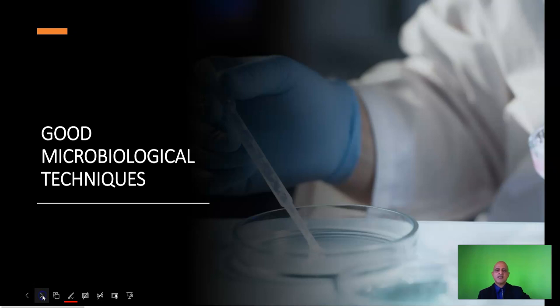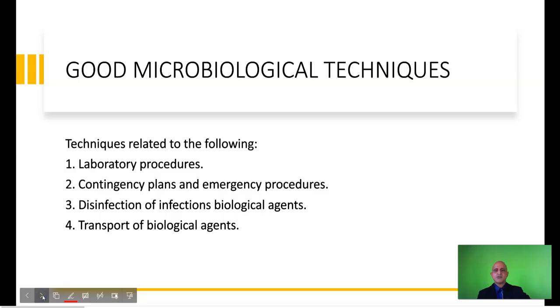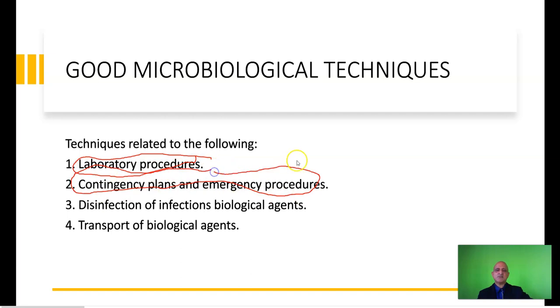Okay, we now move on to the next part, which is good microbiological techniques. Good microbiological techniques are an element of biosafety, and these pertain to laboratory procedures, which are listed in your standard operating procedures, contingency plans and emergency procedures in case of a breach of containment, or, for example, you may have laboratory operators who may get sick in the middle of a procedure and they may have to be evacuated.